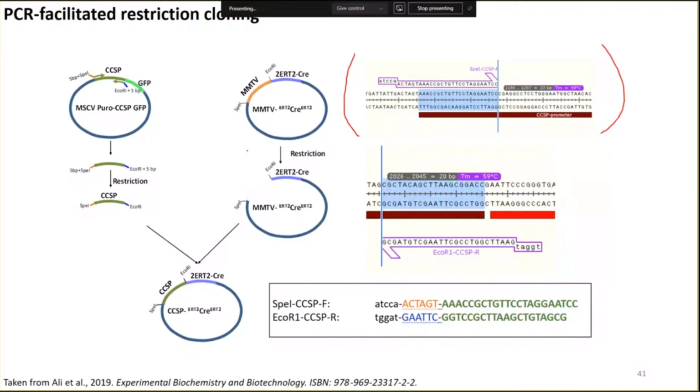Our brain cannot, but software does everything for us. Forward and reverse primer should not have melting temperatures differing from each other by more than 3 degrees centigrade. Our brain cannot very easily analyze all these combinations and attributes, so that's why we get help from the software. I usually teach about manual primers and different cloning strategies, but today I did not, because I was majorly using the software.